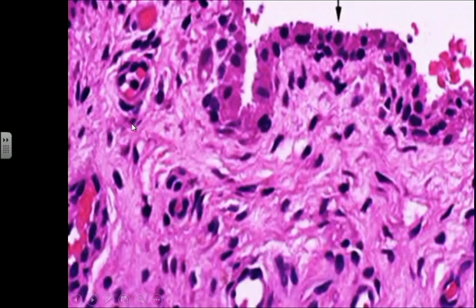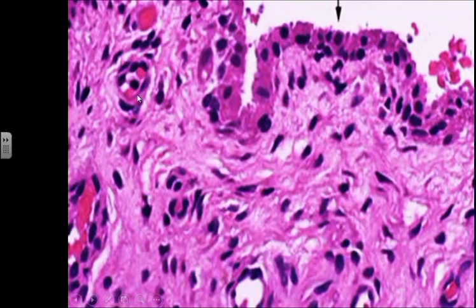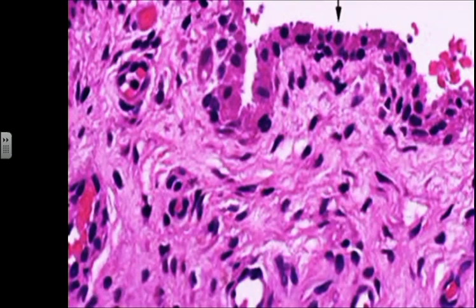Underneath the synoviocytes, there is connective tissue — loose fibrous tissue. We can see the short nuclei of the fibrous tissue and the collagen fibers. There are also some blood vessels, identifiable by the red blood cells, and we can even have nerves inside the connective tissue. And that's what forms the lining of the joint.